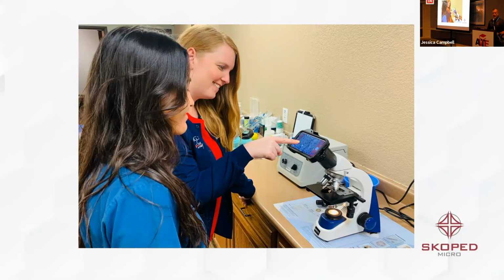That's one thing I like. And I don't think I've said this, maybe I did, but we make a universal adapter and we make the custom adapters. Universal adapters work. Hey, Kiara found it. Sweet. Toss it. I catch it. Oh, come on. So universal adapters. Now we've lost a washer in there in transit, but this can just hook on any phone and you just tighten it down on the eyepiece. And so in a classroom setting, this would work decent. It's a lot better than the old hang it over the eyepiece.